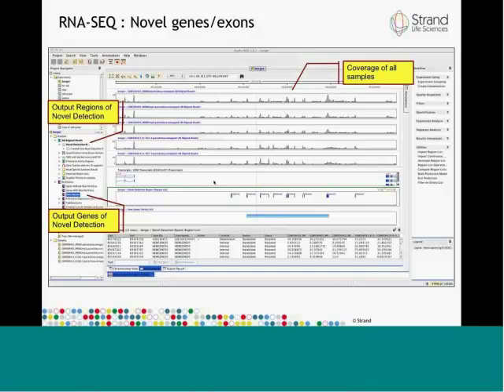And again, you can see that Avadis today doesn't compute a new transcript at this location, but it just calls out a novel gene, and that is shown by this location. And in the future, when we have the ability to update transcript models, one can imagine that these regions that form part of the gene would most likely be called as the exonic regions of that transcript.